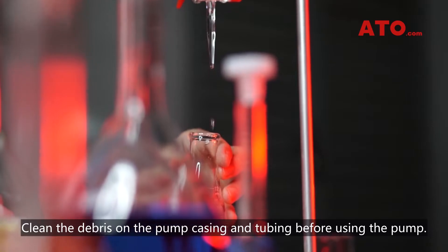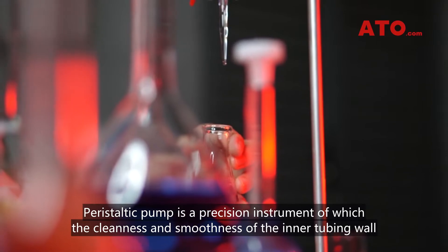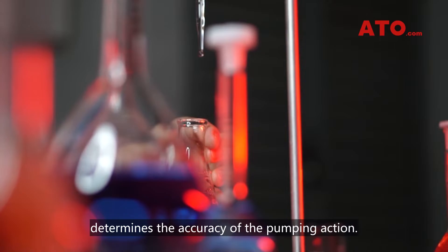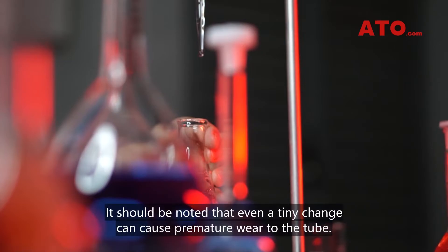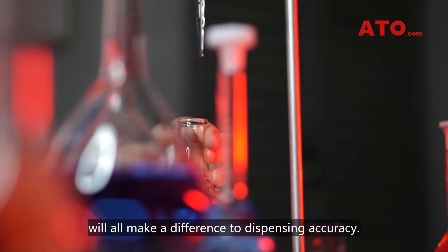Clean the debris on the pump casing and tubing before using the pump. Peristaltic pump is a precision instrument, of which the cleanliness and smoothness of the inner tubing wall determines the accuracy of the pumping action. If there is some damage to the tubing, it's possible that the pump liquid will stick to the roller, shoe or tube, changing the length of tube between rollers. Even a tiny change can cause premature wear to the tube, and any damage, tube residue on the inner wall, or suction pressure will all make a difference to dispensing accuracy.